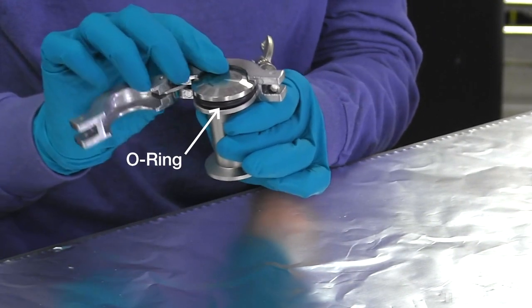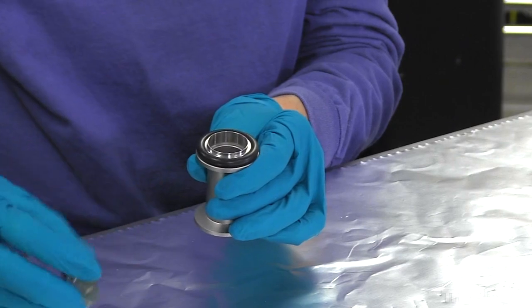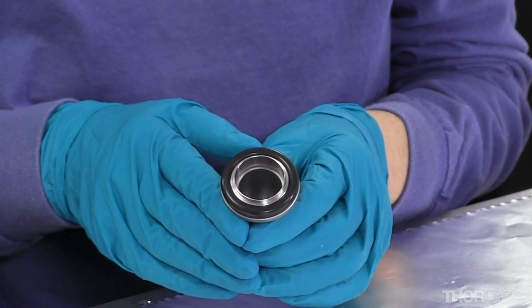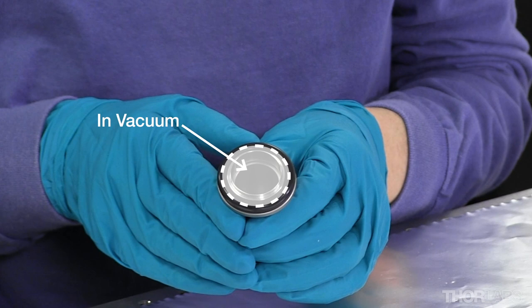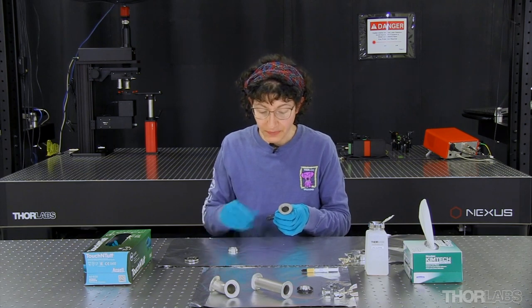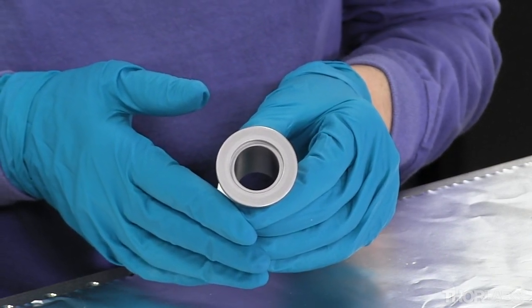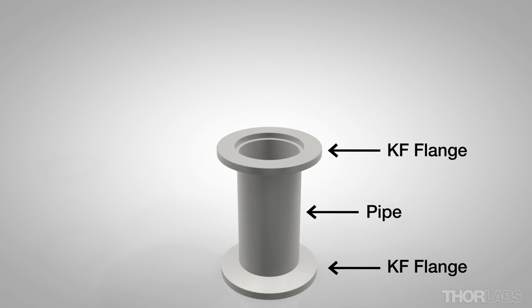Now you can see the o-ring that's compressed between these two flanges. The o-ring is an elastomer gasket, and it's the o-ring that makes the vacuum seal between the two flanges. The circle of contact between the o-ring and the flange is a boundary between atmosphere and vacuum — everything on the inside of the circle will be in vacuum. The o-ring is mounted on a centering ring, also sometimes called a carrier. The centering ring and the o-ring are separable. KF vacuum flanges always include a smooth flat sealing surface that extends to the outer edge of the flange. KF flanges are genderless, so as long as two flanges are the same size they can be coupled together.